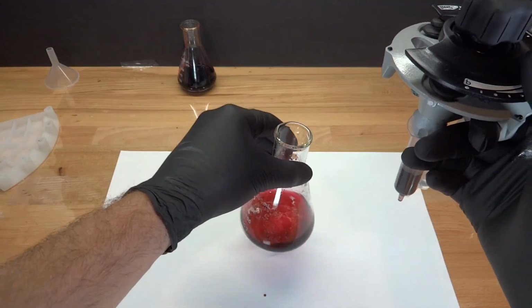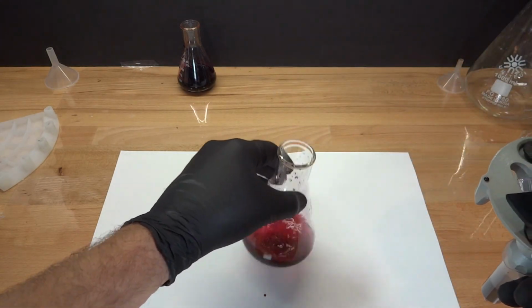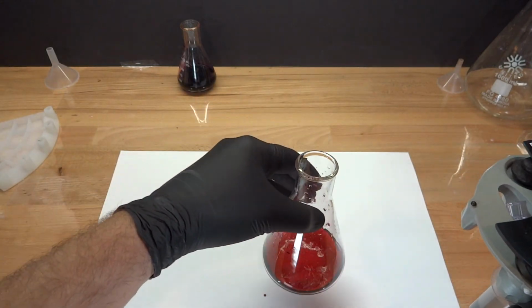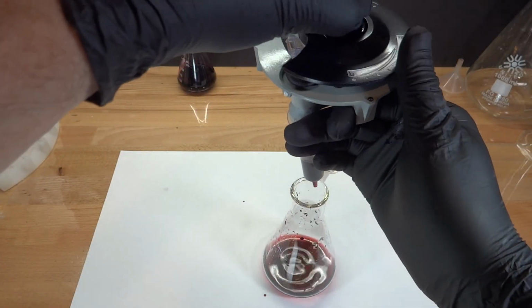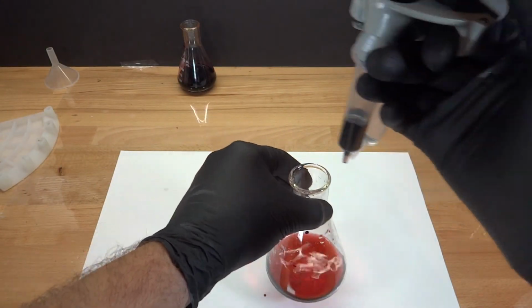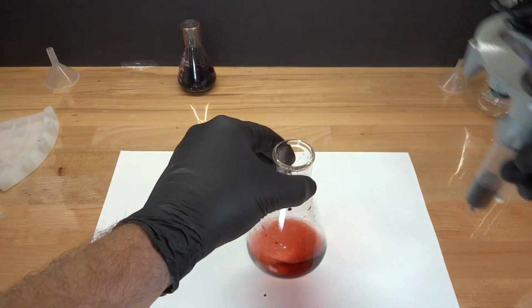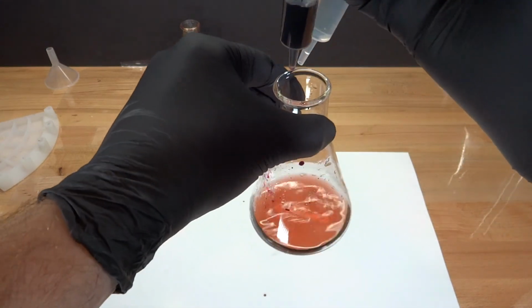Be sure to wear gloves, safety glasses, an apron, and to have adequate ventilation. Keep a jar of baking soda nearby as you might have to neutralize the sulfuric acid. Never add water to acid. Instead, add sulfuric acid to a mixture of water and baking soda. Don't flush anything down the drain without proper inactivation. If you cannot chemically neutralize the discards, please dilute them with generous amounts of water.